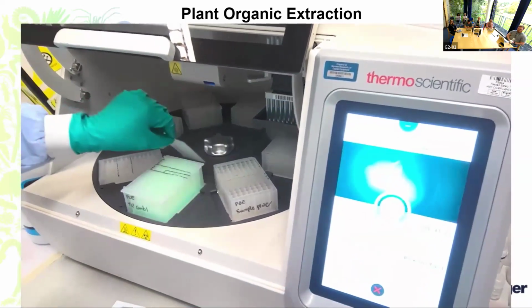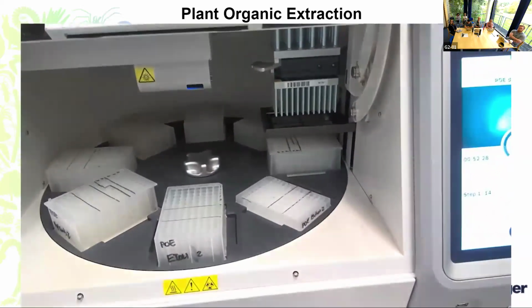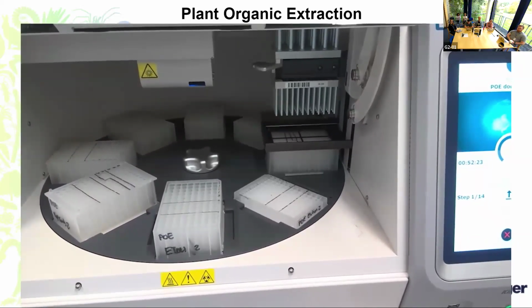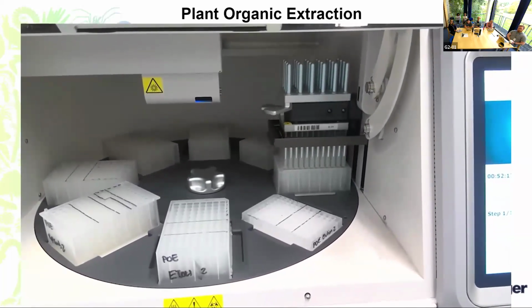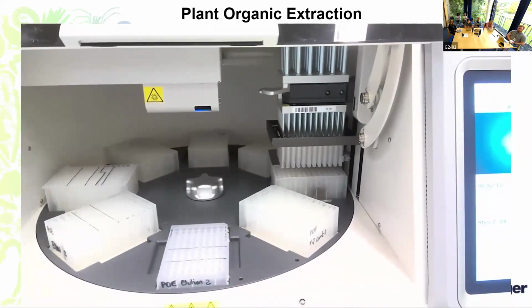The outcome of this protocol, highly dependent on the species and the phenotype observed, will be 1 to approximately 20 micrograms of high quality, ultra high molecular weight gDNA, which can then be shared and used for long read sequencing, PacBio long read sequencing.